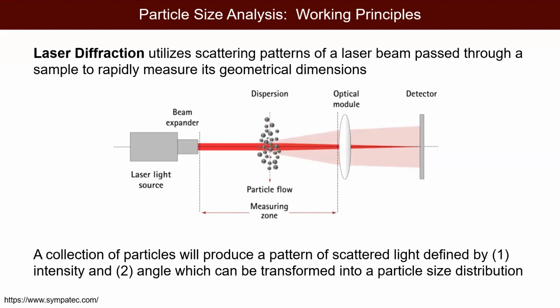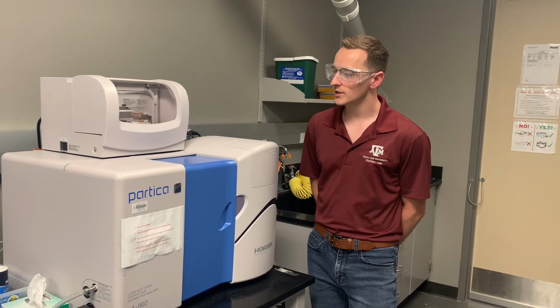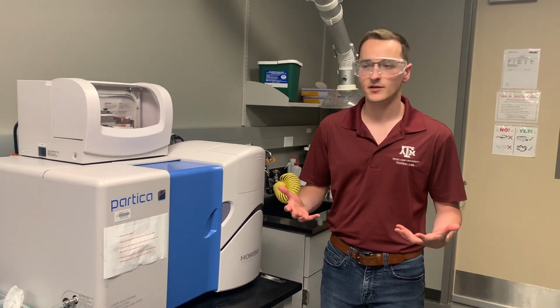One of the most common applications is the determination of the weight average molecular weight, M_W, of macromolecules such as polymers, proteins, or viruses. This technique can also be used to determine the radius of gyration, R_G, or the form and structure factors. Finally, the measurement range for this instrument is 10 nanometers to 5,000 microns. Depending on the method selected, a user will need as little as 10 milligrams or as much as 5 grams of sample. A typical measurement takes about 60 seconds, again dependent on the method selected, from liquid filling, sampling, and measuring to rinsing.